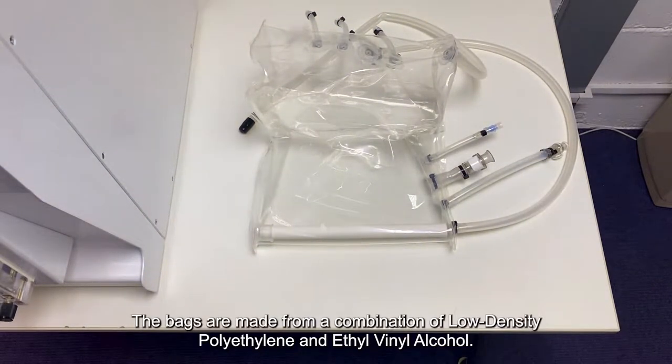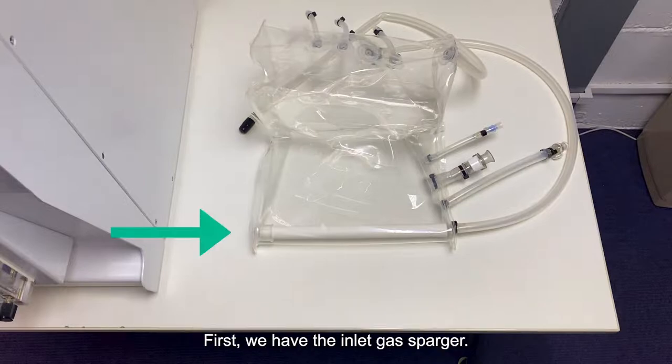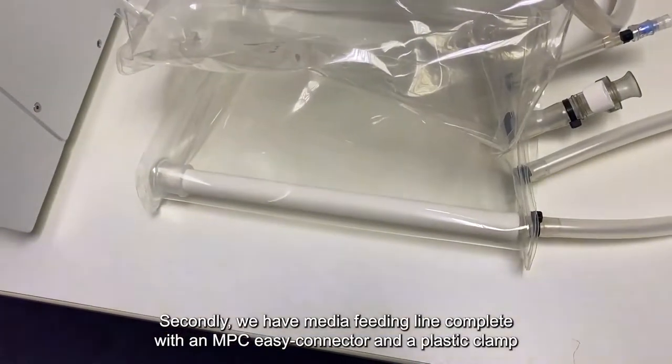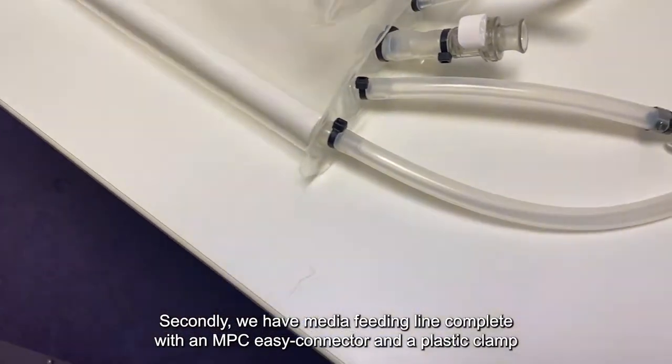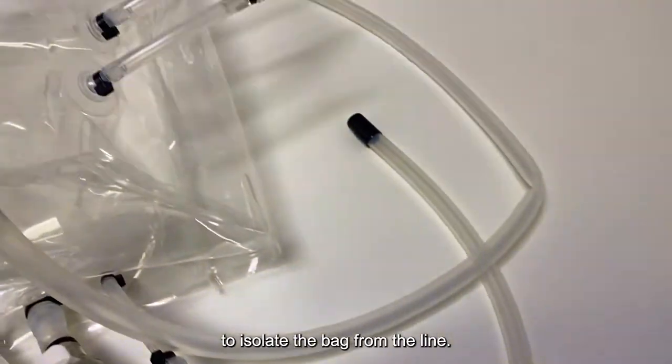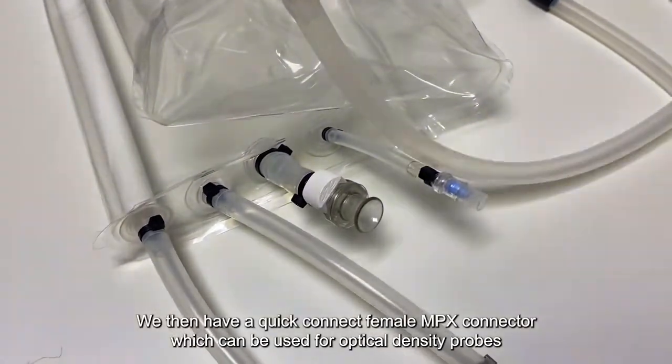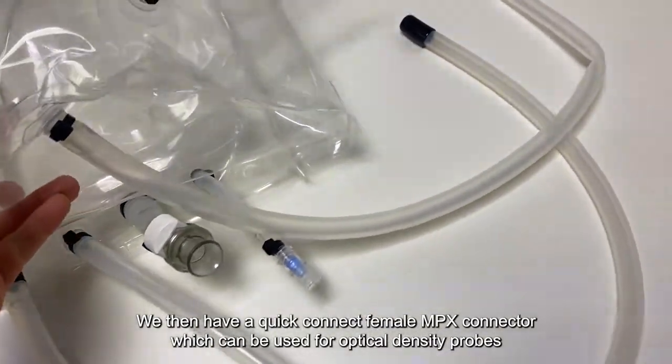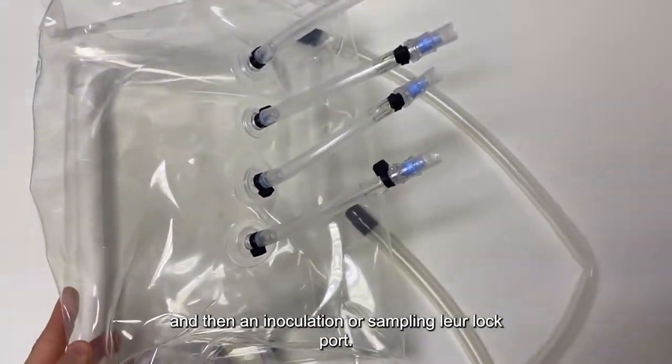The bags are made from a combination of low-density polyethylene and ethyl vinyl alcohol. First, we have the inlet gas sparger, and this is the driving force of the reactor as it provides gas for mixing, but also gas for cell metabolic requirements. Secondly, we have the media feeding line, complete with an MPC EZ connector and a plastic clamp to isolate the bag from the line. And then we have a quick connect female MPX connector, which can be used for optical density probes, and then an inoculation or sampling luer lock port.